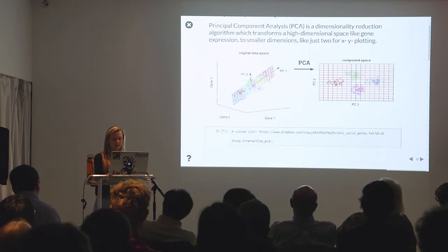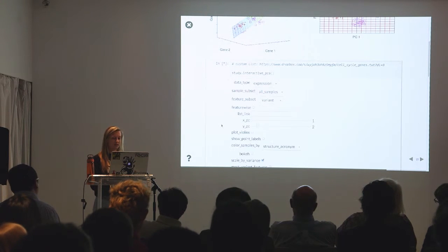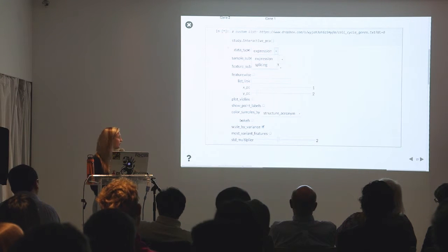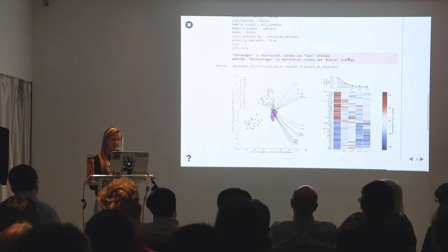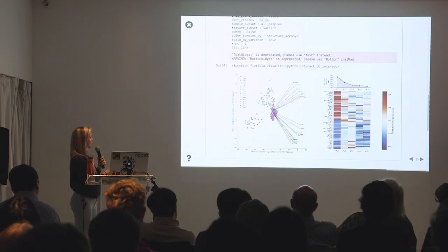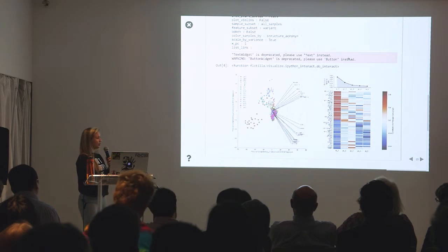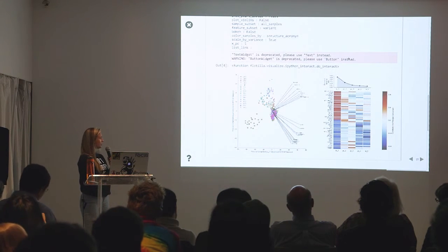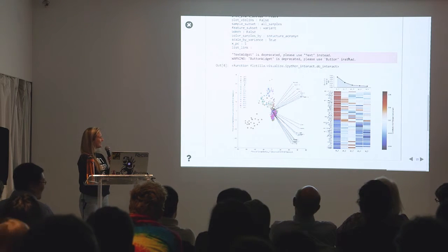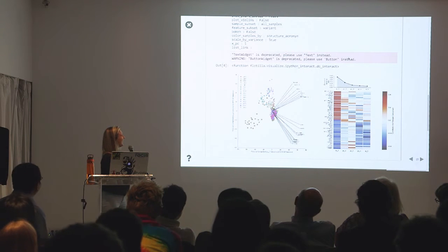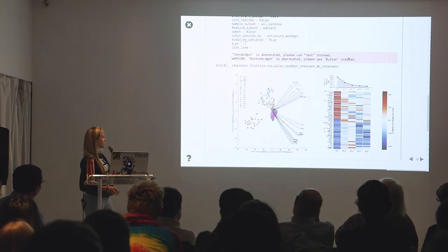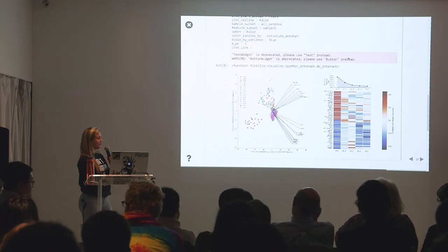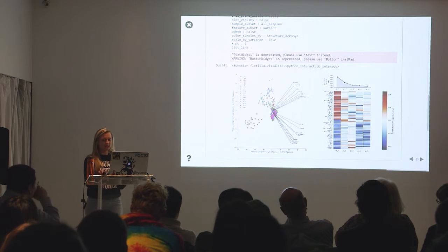So let's get started. We have this interactive PCA function. The data — we support both expression and splicing data, and we only have splicing data in this one. As you can see, we have several different sample subsets. Let's look at the graph itself. These orange squares are the cerebellar cortex data, these purple triangles are the striatum, the teal squares are the mediodorsal something of thalamus, and the orange triangles are the amygdala. Everything else is kind of smooshed on top of each other. It looks like the difference between the cerebellar cortex and everything else is contributing a lot to the variance. So let's take that out.